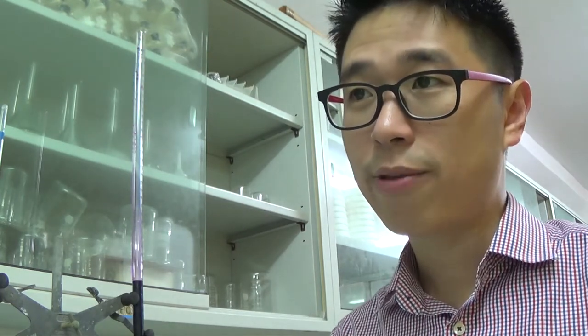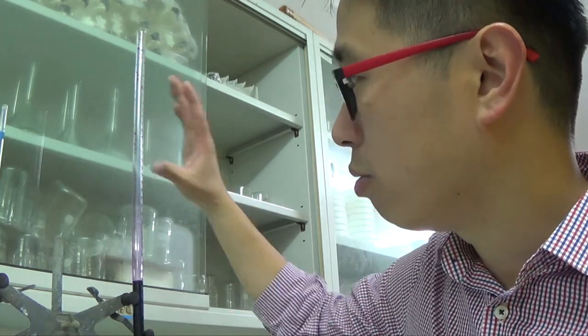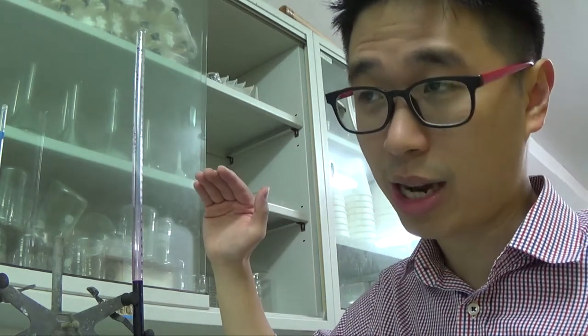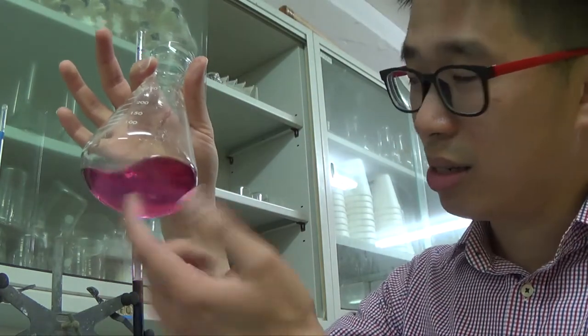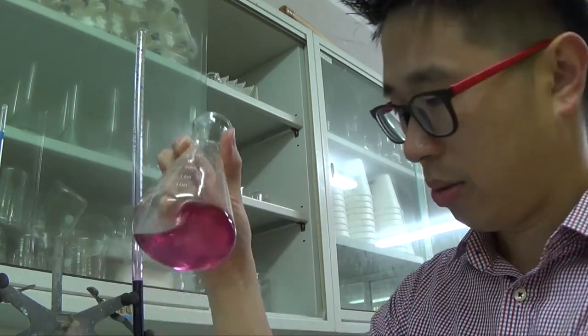If you know the rough titer, then later on, you will know where you started, and then you will slow down as you reach the volume of this rough titer, because you know that is close to your endpoint. You do not want your endpoint to be this. This is excess KMnO4 already. You want your endpoint to be from this color.